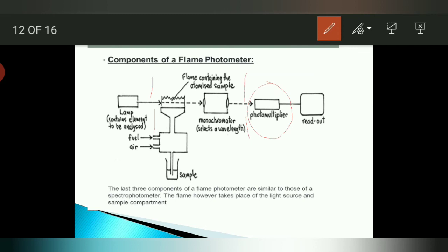The photomultiplier tube should be placed so that the beam of light emerging from the optical system covers the entire photosensitive area. If the detector is too close to the exit aperture, only a small region of the photosensitive layer will be utilized. If, on the other hand, the detector is placed too far, some of the light will not reach the photosensitive surface. In a good instrument, the photodetector has to be correctly adjusted for flame emission spectroscopy.